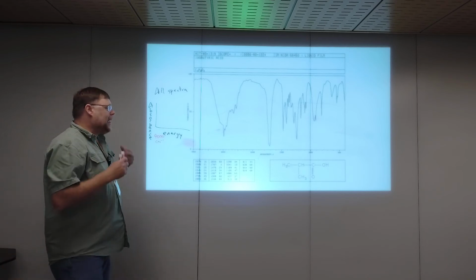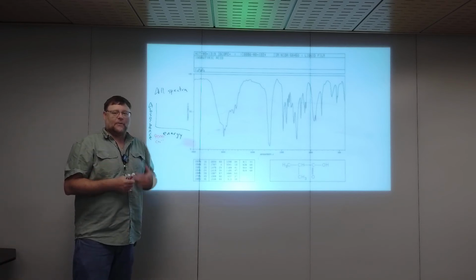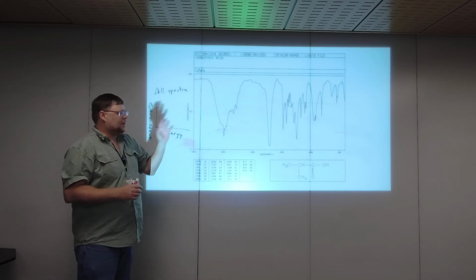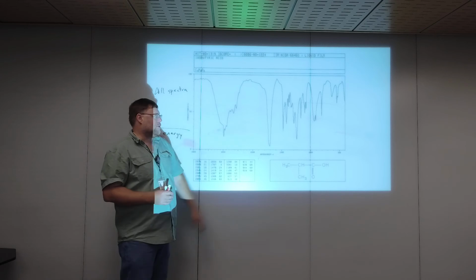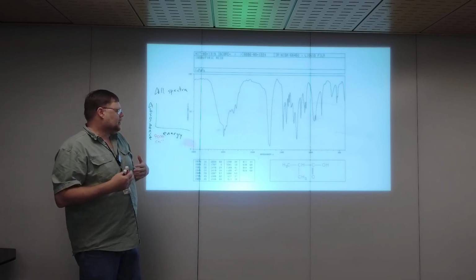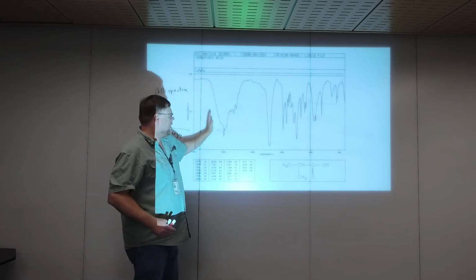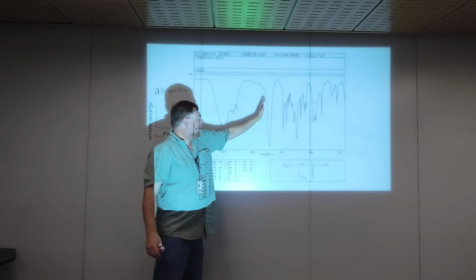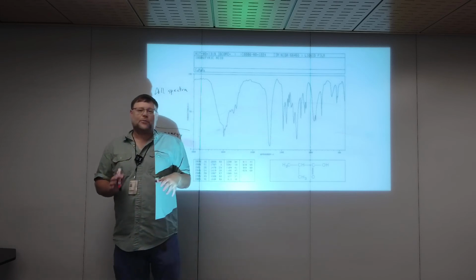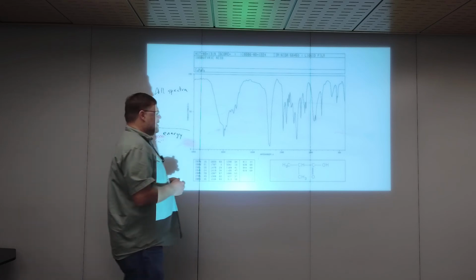Okay, so you can't solve an entire molecule from an IR spectrum. If I give you an IR spectrum, there's no way to know exactly what the entire molecule is, unless you have a catalog and you can go to the fingerprint region. What you can do is get functional groups, all right? And so again, we've got XH bonds, and then in the middle, we've got double bonds. So probably the first place to start, the first stretch to learn is the CO double bond.